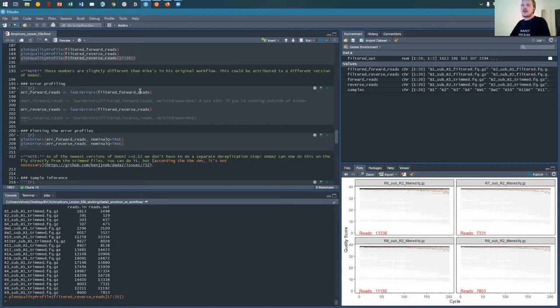So you sacrifice speed in that case. But for me, I have an okay computer, so I'm going to try and run it with multi-threading and see what happens. And I'm going to comment out this one because I want them just to run right in a row.